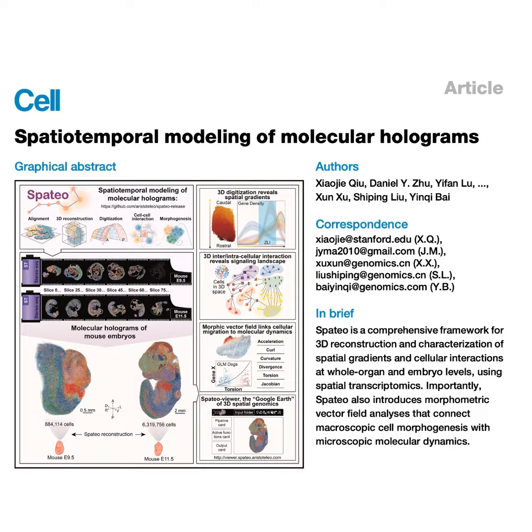Spateo uses a computational strategy called stratified subsampling. Stratified subsampling. Okay, how does that work? The algorithm analyzes the spatial transcriptomic data and groups the cells into localized transcriptionally similar clusters. So if you have a cluster of 100 cells packed tightly together in the developing midbrain, expressing the same baseline genes, the algorithm just selects a single representative exemplar cell. So instead of calculating every single cell, it picks an exemplar.